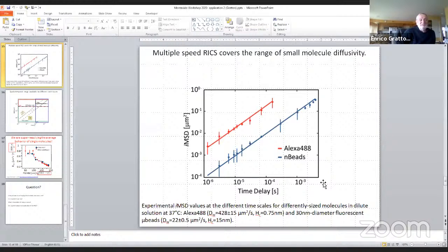So essentially in the other region there is no limit, but you can never cross this line. So you stop at that point. And even if you exchange the space for frequency using the spatial Fourier transform, still, you cannot explore that enormous change that you have here with the line.